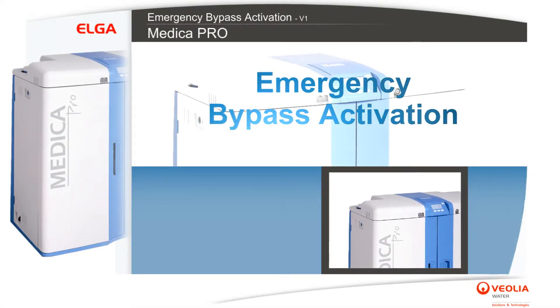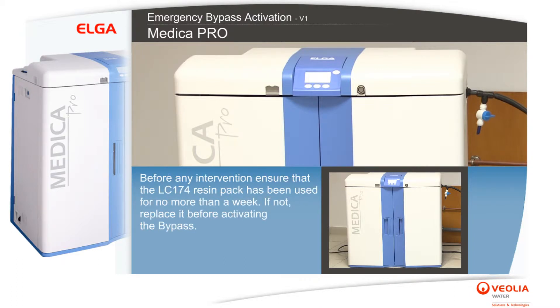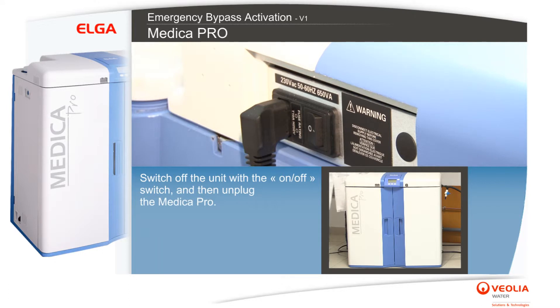Emergency bypass activation: the emergency bypass is activated in the case of failure in the RO process mode or with the recirculation pump. Before any intervention, ensure that the LC 174 resin pack has been used for no more than a week. If not, replace it before activating the bypass.